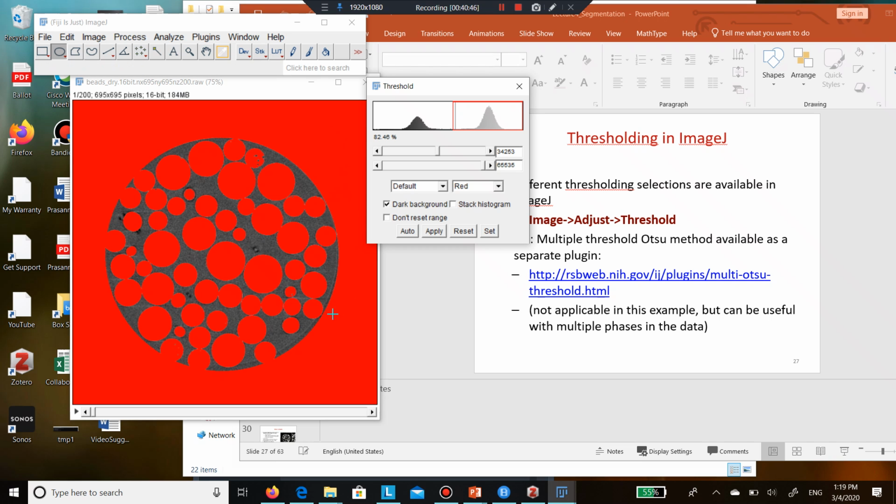So I would actually have to go and find where my default value of the outside is, because it's taken into account. This is Default. Otsu is that famous method. It works better in my case. Look at this little bit of business going on right outside of this.